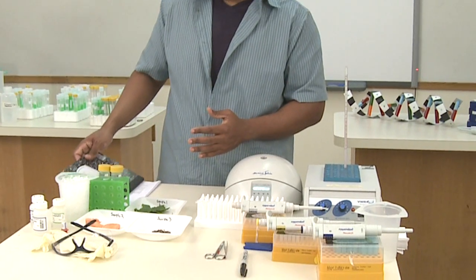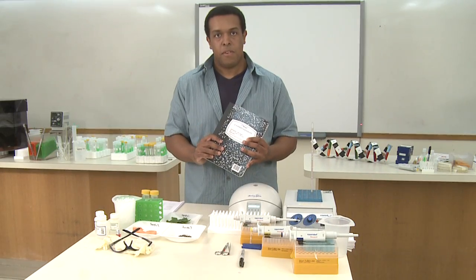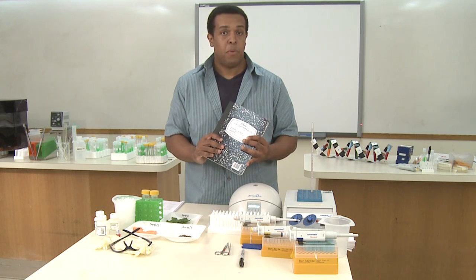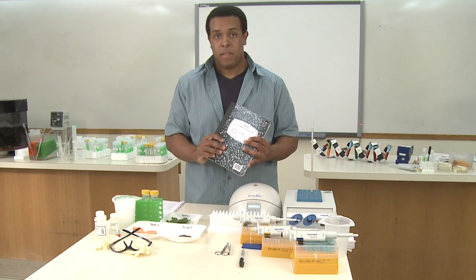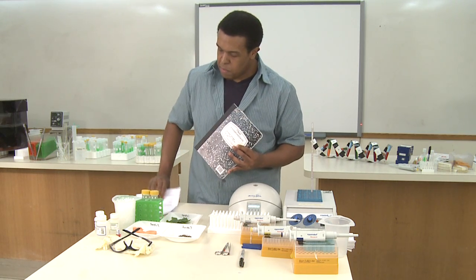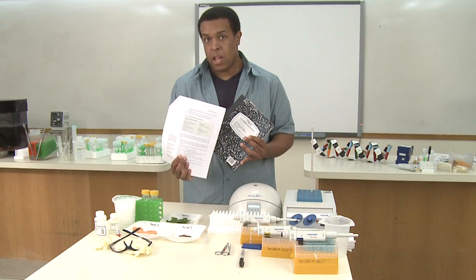One of the most important things you'll need is a notebook. You want to note all of your samples, give them a number, an ID. I'm just calling mine sample 1, 2, and 3. Note who collected them, note where they were collected, as well as any other information that you require. It'd also be helpful to have a copy of the protocol to follow along.